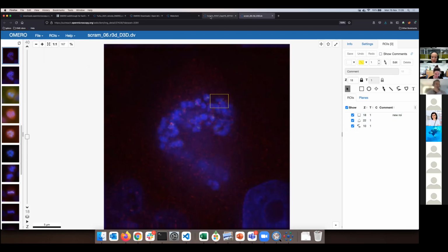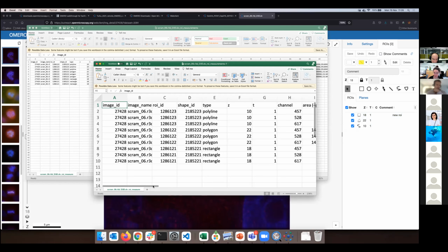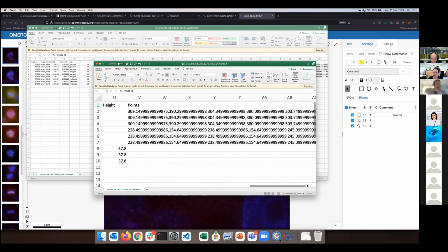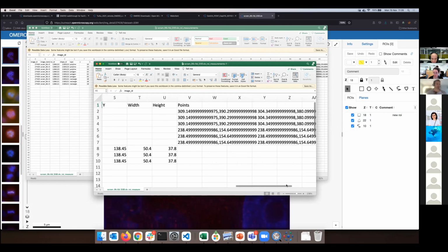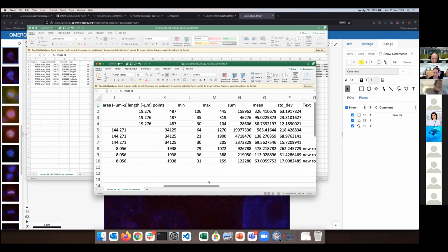There's a question by Joanna about how we define the exported measurement. It's currently hard-coded, but it's something we can revisit as a community. If people think we need to extend it, that's something we can do, because we already discussed saving the very minimum, and then people wanting more information about that region of interest, and it's been a kind of low priority compared to other things.